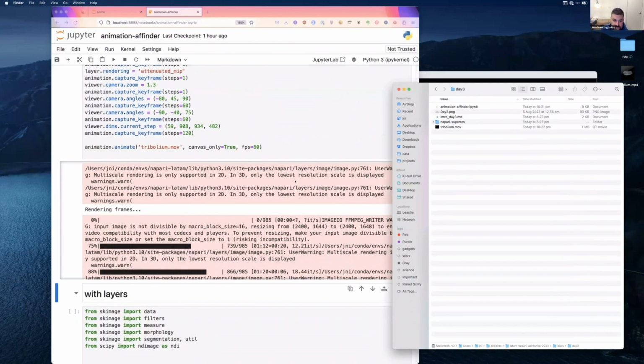Yeah, so the way that Napari works with Zarr files is you load a Zarr array, which is basically a pointer. It doesn't actually have any data. Then when we move the slider in Napari, Napari calls np.array on that particular slice of the Zarr array, so it loads the data at that point. The data doesn't stay in RAM, it just loads it while it's displaying it. Because Napari animation is moving the slider for you, that is exactly what it's doing to access the Zarr file. It moves the slider, and then Napari takes care of loading the data set at that point.